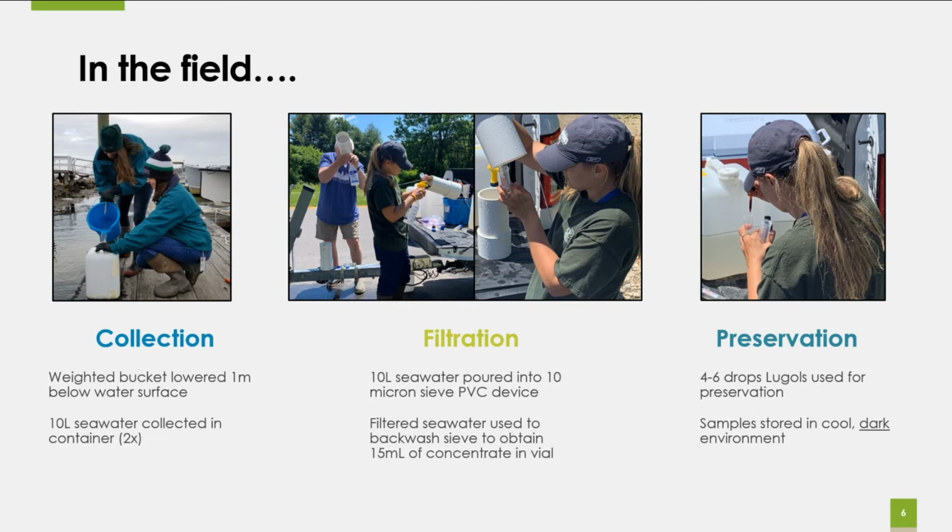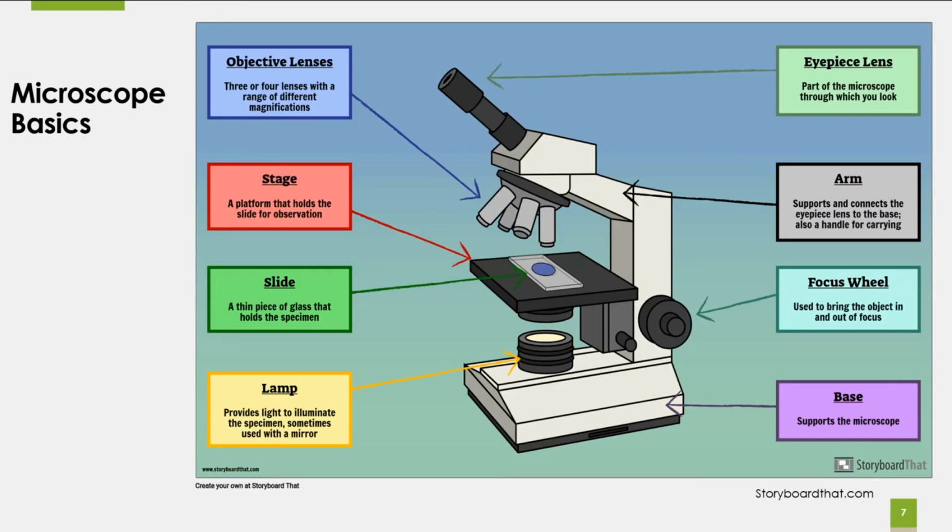All right, moving on to microscope basics. I found this little image online that goes over the basics of a microscope, and it looks very similar to the one I have here, which you are free to look at during break. I'm sure you've all seen a microscope up close, but just to review, you have your eyepiece lens, which in this picture there's just one, but typically there's two. I don't think I've ever used one with just one eyepiece lens. I think Amanda's has two as well. So there's two eyepiece lenses here.